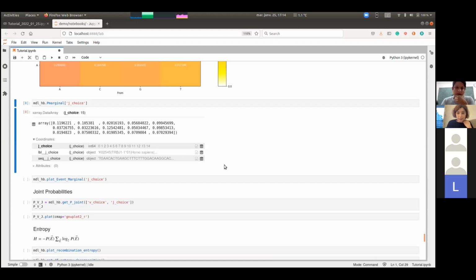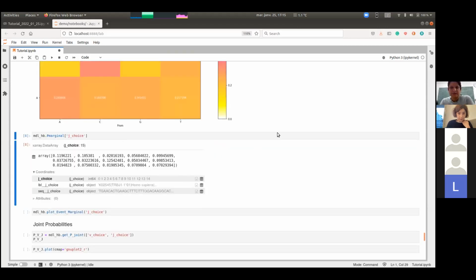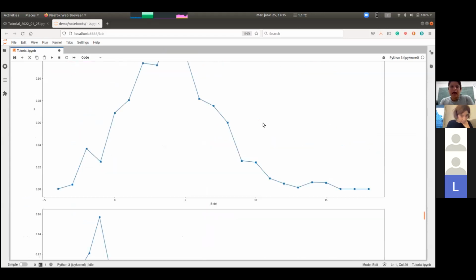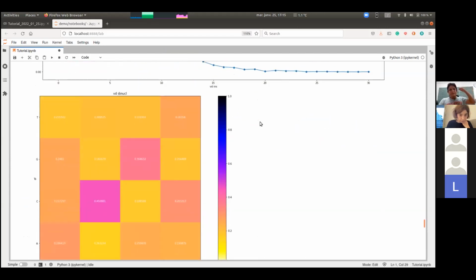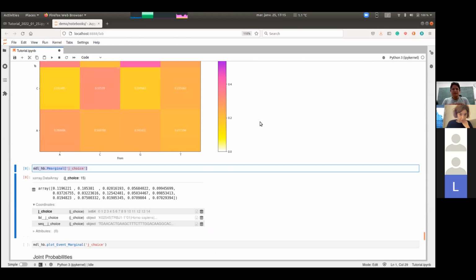So what we're looking at here, Carlos, are the marginal probabilities of the model, the things you plotted? Okay, what I'm showing here are these marginal probabilities that I just plotted. Let me emphasize that IGoR has these marginal files, but these are not the mathematical marginals, in the sense that you marginalize over all the variables. These are the real marginals for one variable.